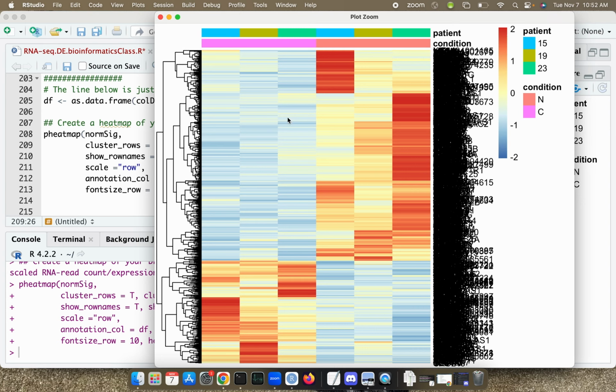So this first block shows a block of genes that are slightly underexpressed in cancer condition, and more expressed or sometimes overexpressed in your normal condition. What you wouldn't want to see in a heat map would be a totally random pattern. If every gene were totally different between samples and between conditions, then we might be concerned about the integrity of our data, our samples.